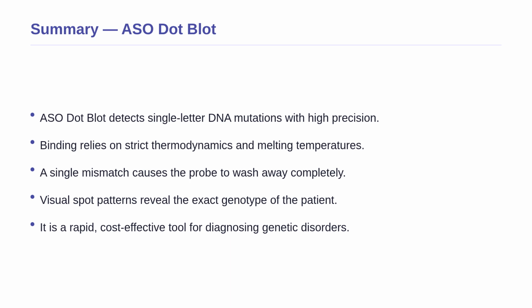Finally, we saw how reading the simple visual spot patterns allows us to deduce a patient's exact genotype, making this a rapid and cost-effective tool for diagnosing devastating genetic illnesses. You now have a complete understanding of both the biological principles and the practical applications of this amazing diagnostic tool. Great job!